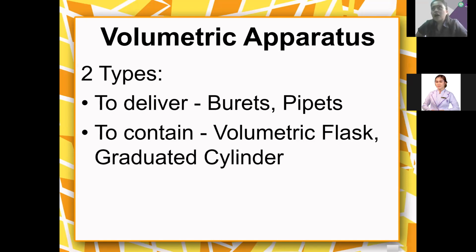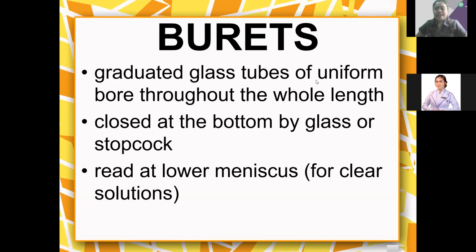Beaker, Erlenmeyer flask, both of them should not be used in measuring volumes of liquids even though they have graduations. The lines there are not accurate. So, magagalit talaga yung teacher ninyo pag nakita niya kayong nag-measure ng volumes of liquids using either Erlenmeyer flask or the beaker.